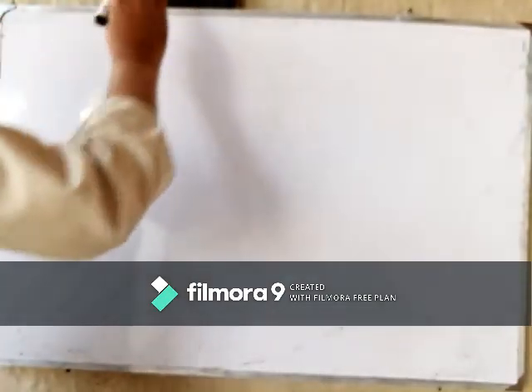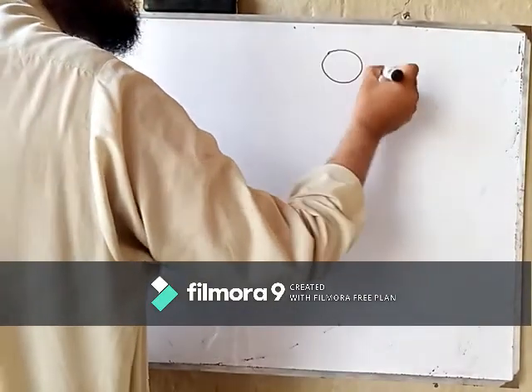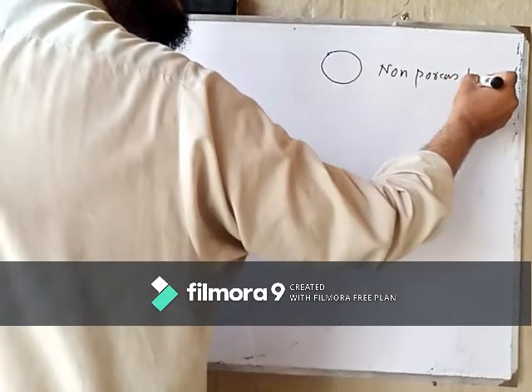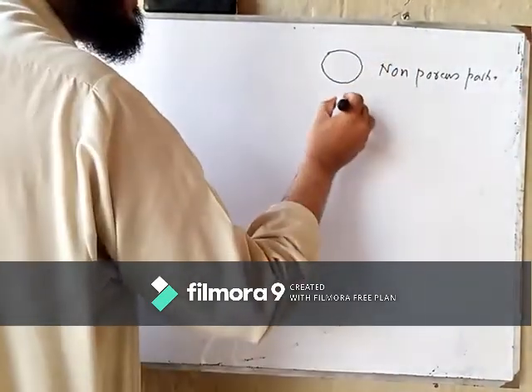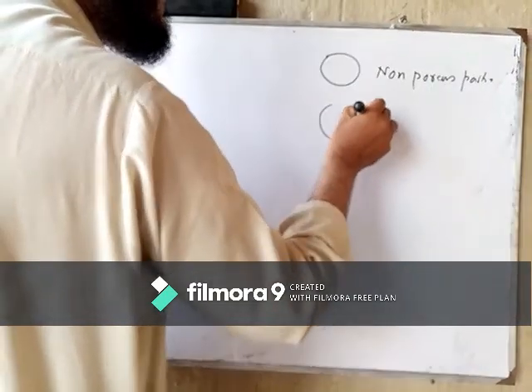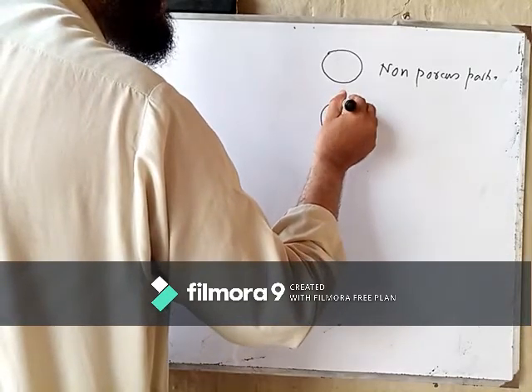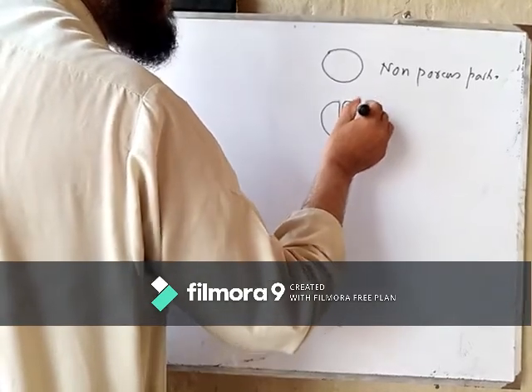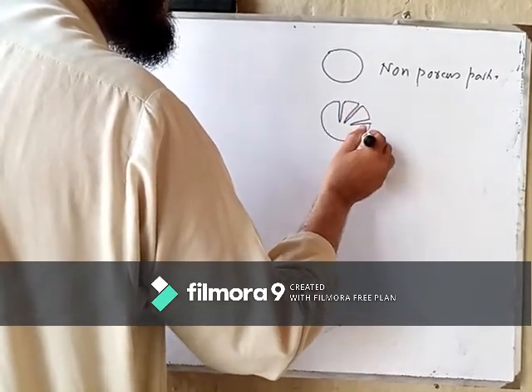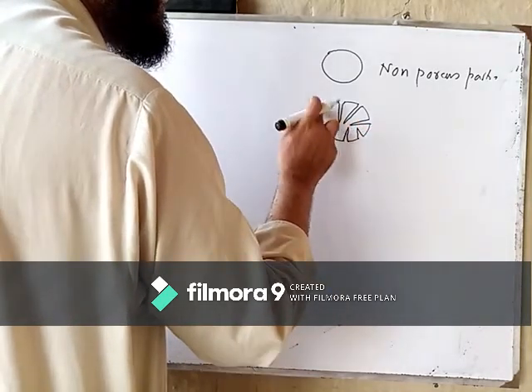If roughness factor is higher, there will be pores, different types of pores.